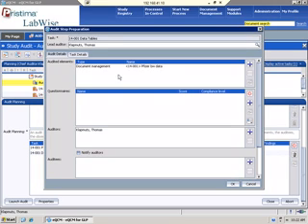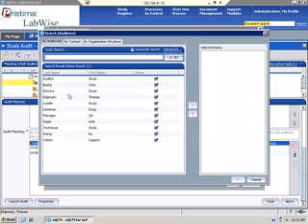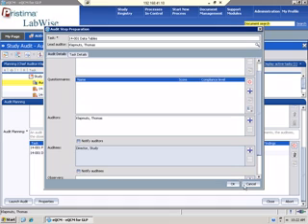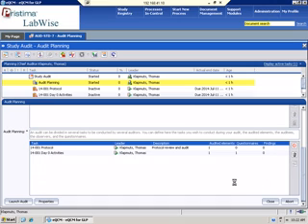Okay, so here we're just linking to body weight tables. There's no questionnaires associated with it. Again, the study director is a responsible person, so he's my auditee. And then, just for time, I'm not going to add the final piece, which is the final report. So now I see that I have all of my audit activities scheduled.